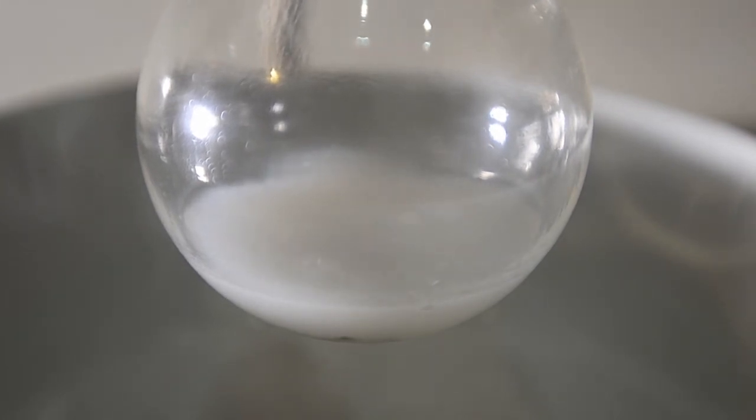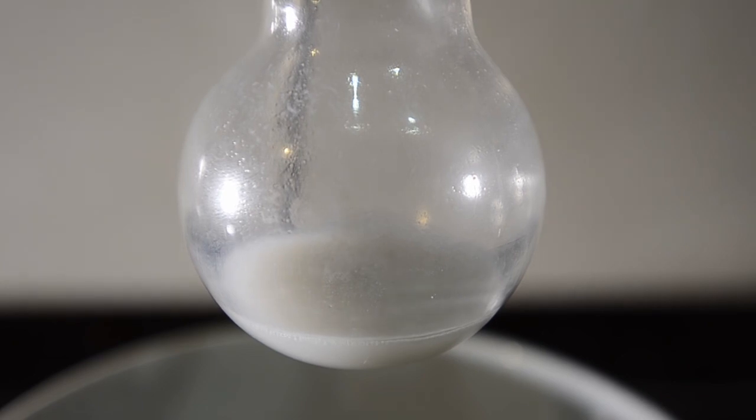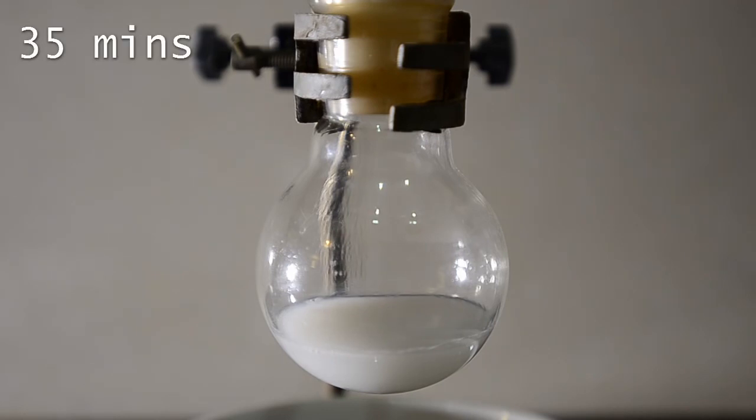If we were going to use our Grignard reagent for another reaction we'd probably want to put a condenser on at this point and stop the ether from evaporating off. The total reaction time took about 45 minutes before the bubbling died right down and we were left with a dirty gray product looking like dishwater. So this works but it takes rather a long time.